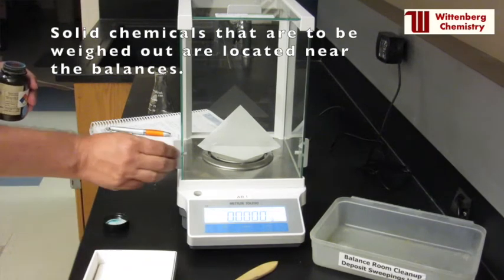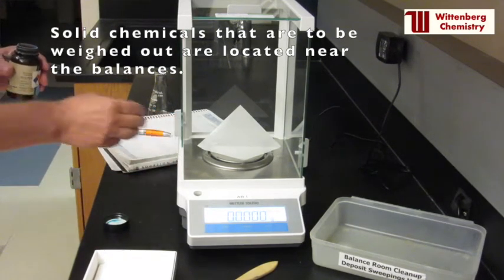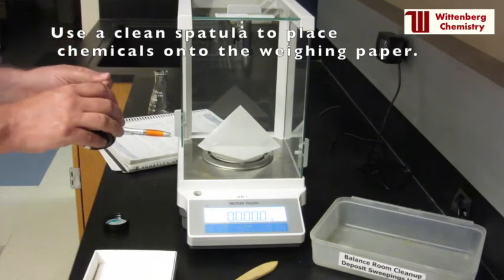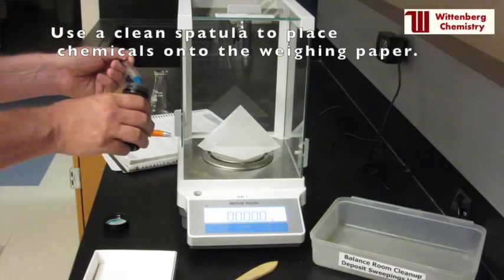Solid reagents are in labeled bottles and are located near the balances. Use a clean spatula to add the solid onto the weighing paper.